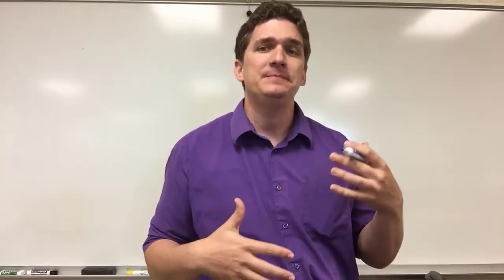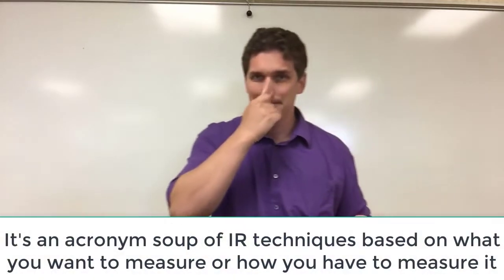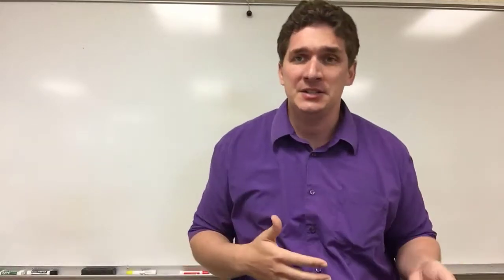Second, there are a wealth of IR techniques. So even though we're going to talk about FTIR, you're going to see practically in the literature lots of different ways of doing the technique. Now, they have advantages and disadvantages.